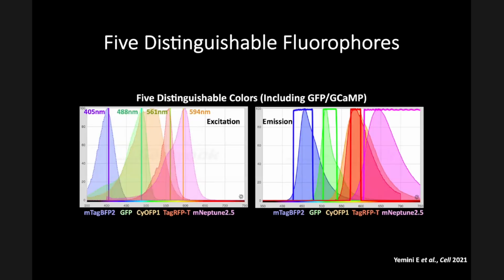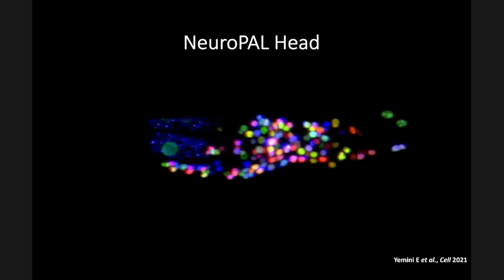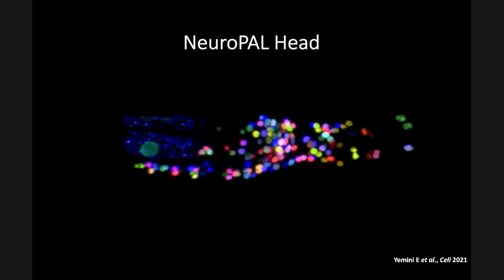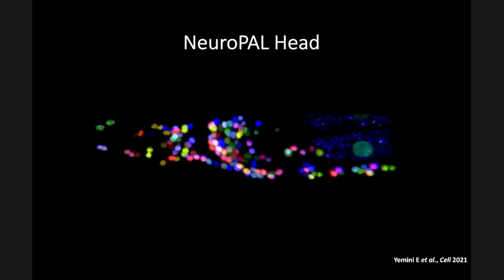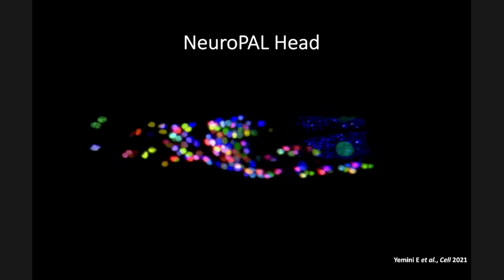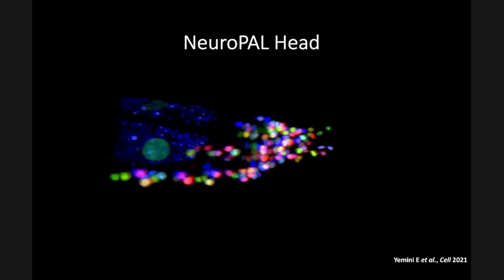ultimately, we have a microscope, and in the case of the original work, it was an oil-based lens for a lot of the stuff, at 60x, and we have this drop-off of signal, right? The further out you go, the less light you get. So you can imagine that the further from the lens you are, the weaker the neurons are. And so you would have to have some model that accounts for that and fixes the anisotropy that takes place, so that you always have a very stable view of the neuron.